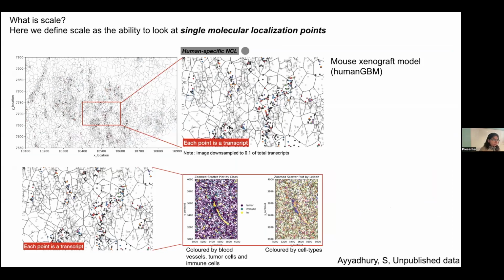Now, this is an example of single molecular imaging analysis output. This is an example from the Xenium, but this is what you'll get even if you use the CosMx or the MERSCOPE. The wonderful thing about these imaging-based systems is that the transcripts really do help. I think they really do make a difference. But again, do you really need it?